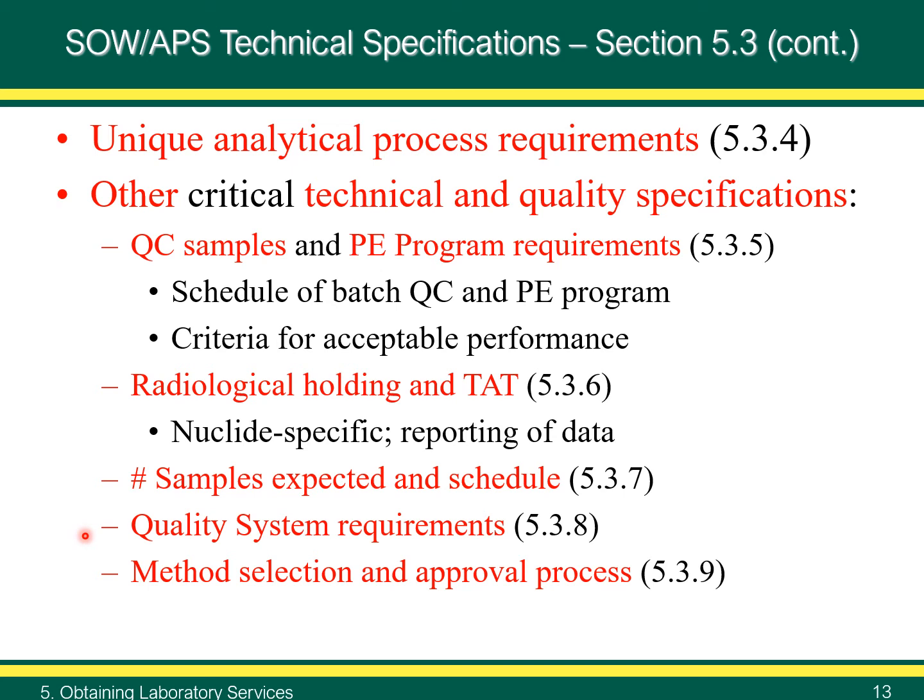MARLAP section 5.3.8 addresses quality system requirements. If the organization or project requires the lab to use a certain quality system process, details must be included in the statement of work.